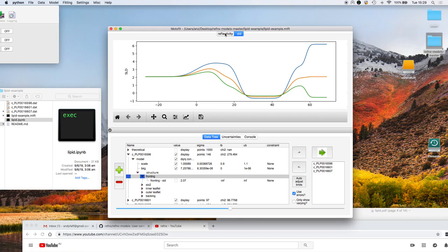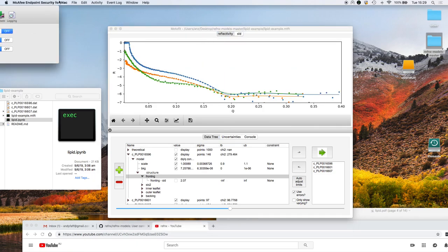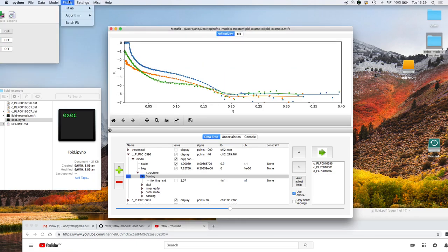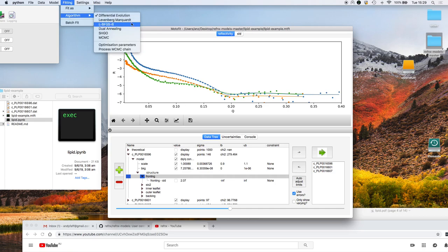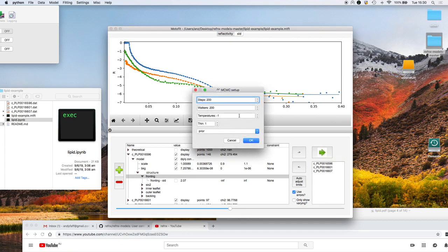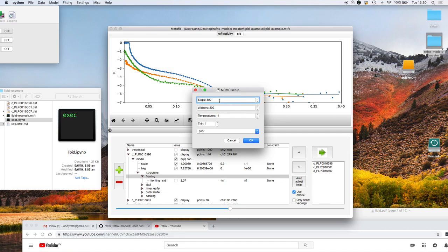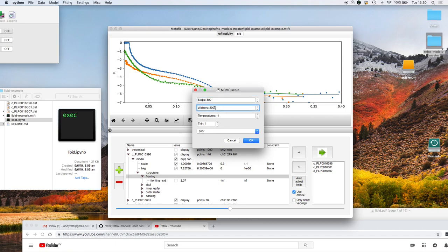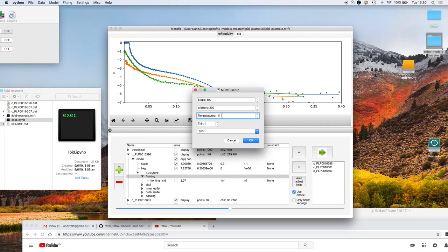All right, so these three data sets are quite well fitted and then we have the corresponding scattering density profiles. We then go to algorithm, choose Markov chain Monte Carlo and click on go. The first thing it comes up with is how we want to do the sampling. I want to do a total of 300 steps. Normally we do say several thousand, like five or ten thousand or so, and the reason for that will become clear later. There are 200 walkers, so in total there's going to be 200 times 300 samples.